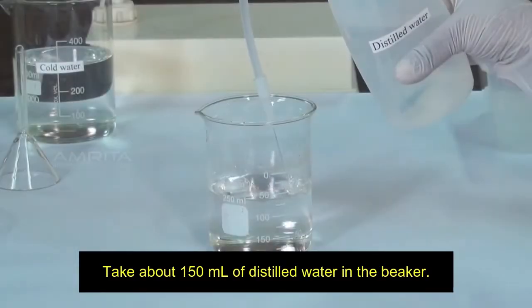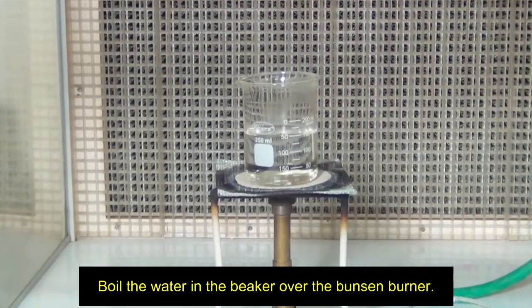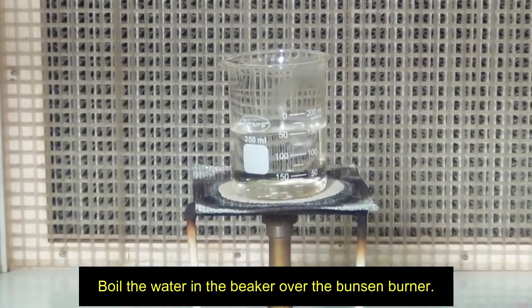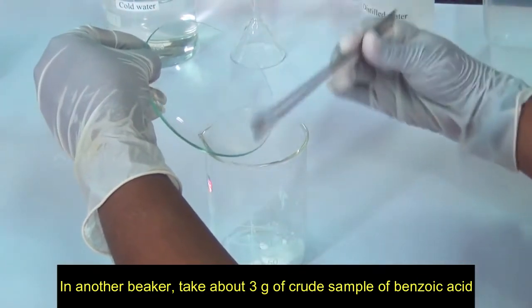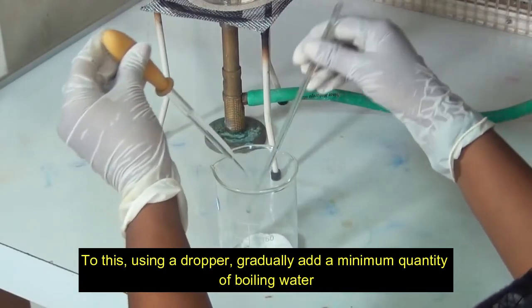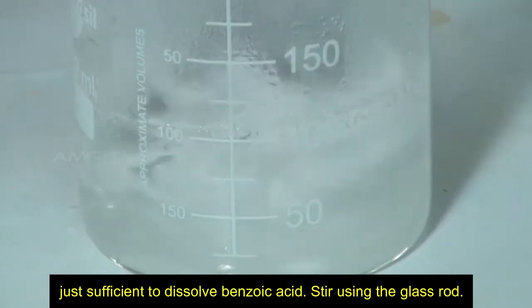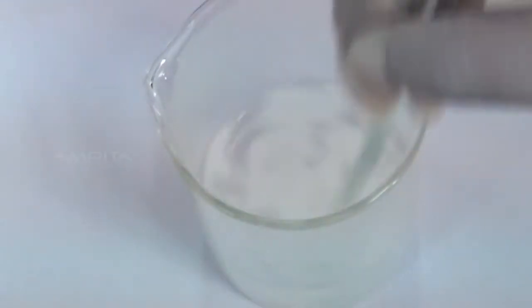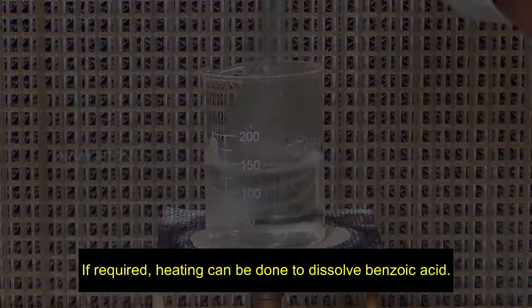Procedure: preparation of solution of the impure sample. Take about 150 ml of distilled water in a beaker. Boil the water in the beaker over the Bunsen burner. In another beaker, take about 3 grams of crude sample of benzoic acid. To this, using a dropper, gradually add a minimum quantity of boiling water, just sufficient to dissolve benzoic acid. Stir using the glass rod. If required, heating can be done to dissolve benzoic acid.